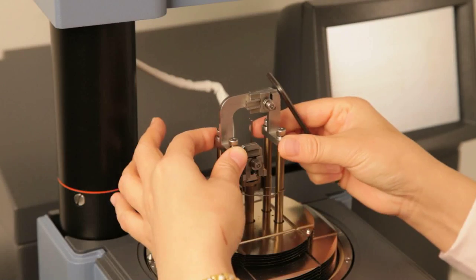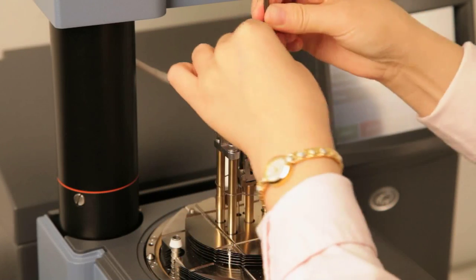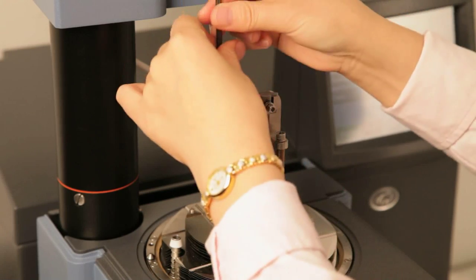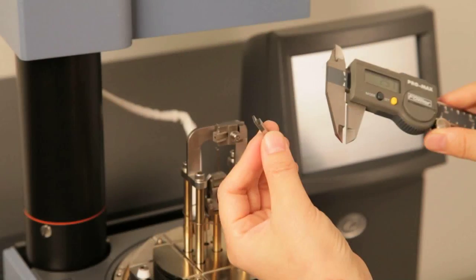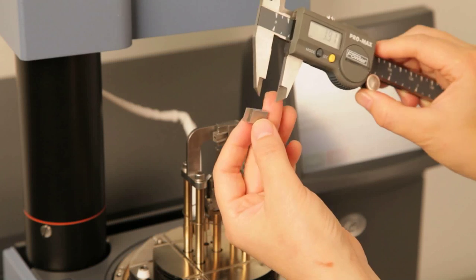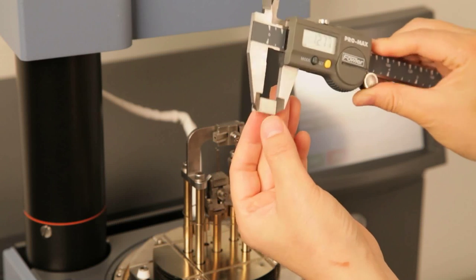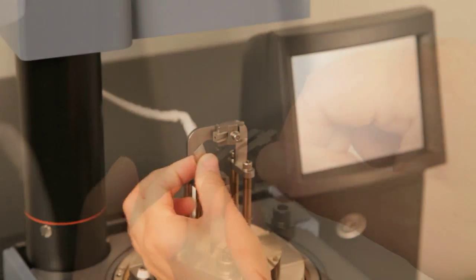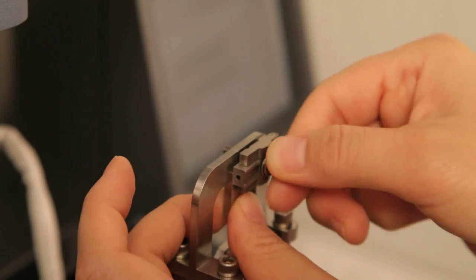For clamp zero calibration, install the stationary clamp to the instrument. Take the offset gauge from the clamp kit. Use a caliper to measure the length of the offset gauge. Then insert it into the upper clamp.